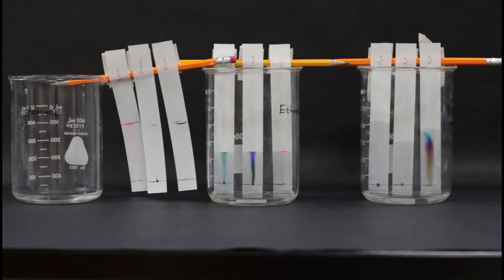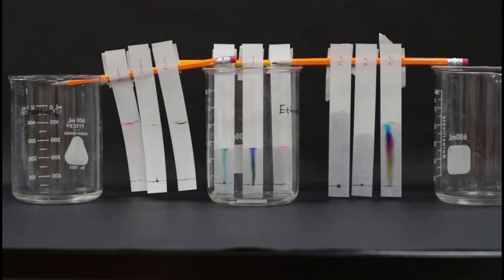If the solvent reaches halfway up the chromatography paper before the 15 minutes is up, go ahead and pull it out, and then mark the highest line that the solvent reached with a pencil, and then let them dry.